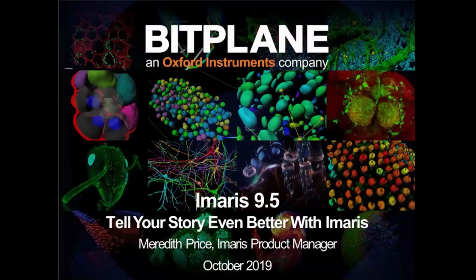Okay, so one question was from Vitali. Hi, Vitali. You're wondering where the 0 is within the spectrum lookup table. You can set the minimum to be 0, and that would be the best thing that I would recommend in that case.